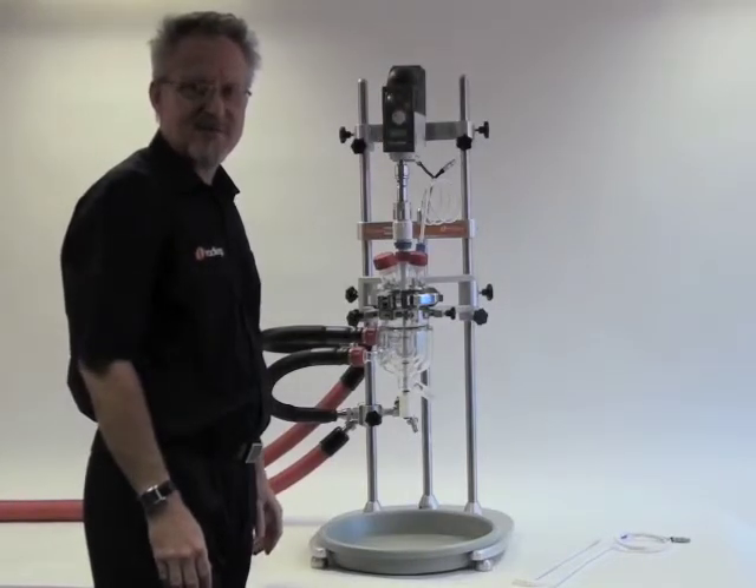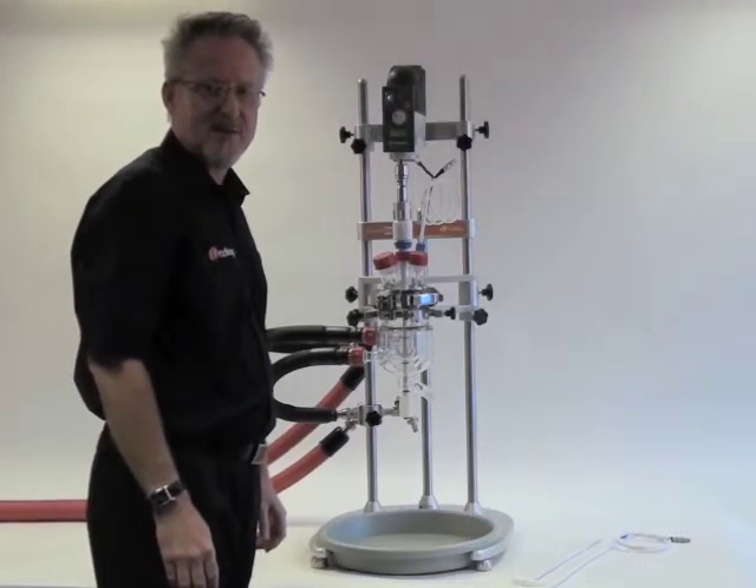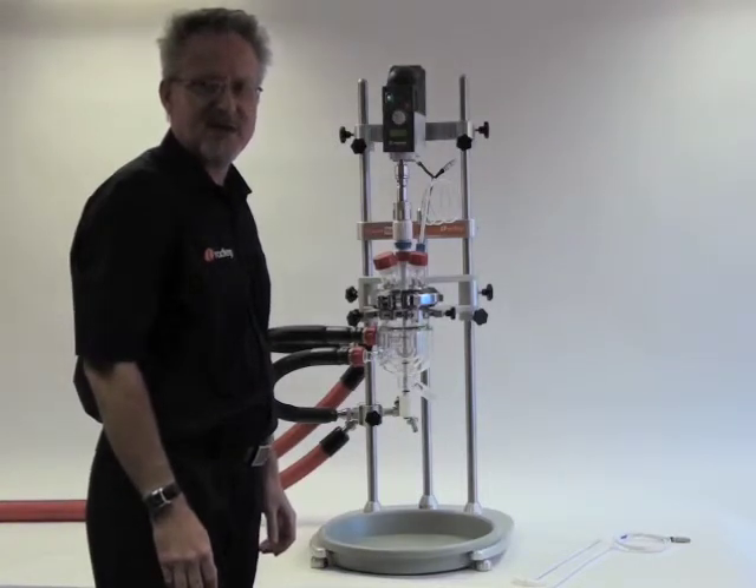Hello, my name is Ed Hartley. I'm Product Manager for Radleys and I'd like to show to you today our new product, Reactor Ready, which is an innovative patented low-cost reactor workstation for jacketed glass reactors from 250ml to 5 litres.